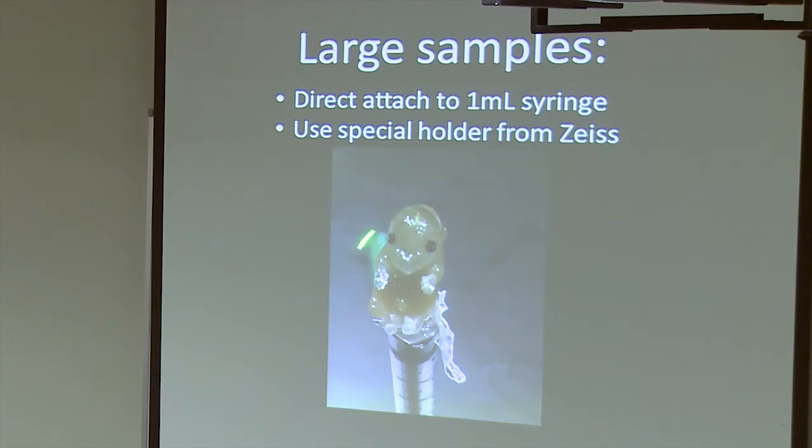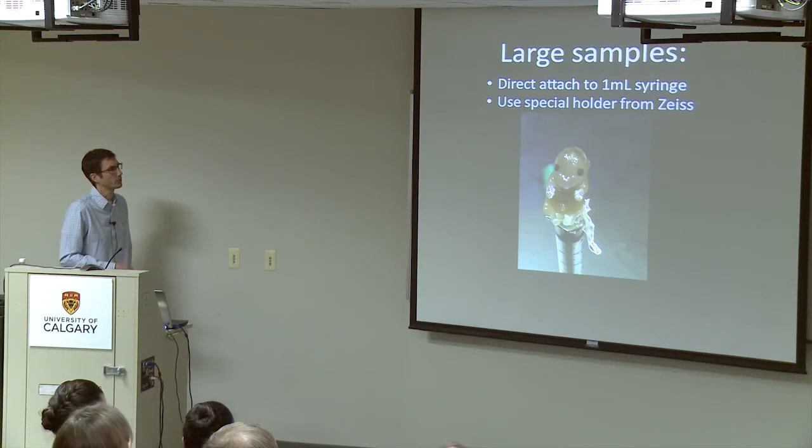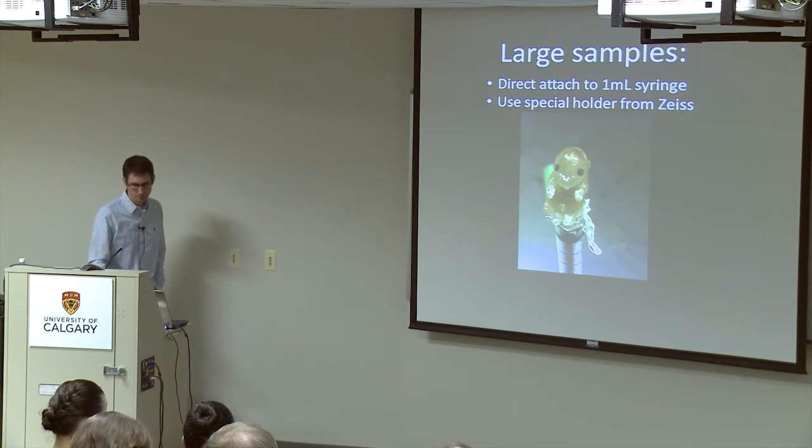So this was an embryo that was cleared with the CUBIC technique. There's also a couple special holders that you can get from Zeiss. But I find this works just as well, and it's pretty easy.